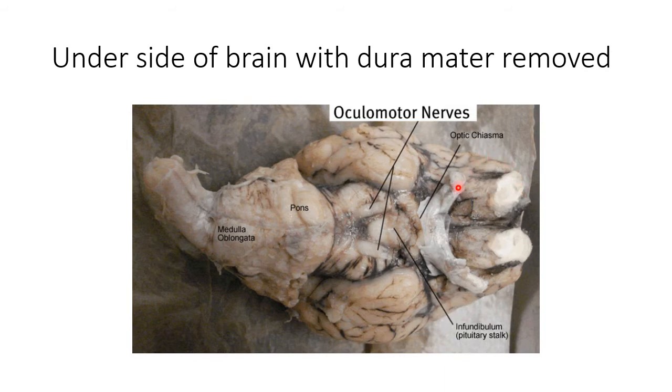Here we have our optic nerve. Optic chiasm here is where it crosses over — some of the visual processes cross over and some stay on the same side; it's all processed back in this part. These are oculomotor nerves and they do just what you think: oculo means eyeball, motor means moving. It has to do with eyelids, pupillary constriction, and that type of thing.